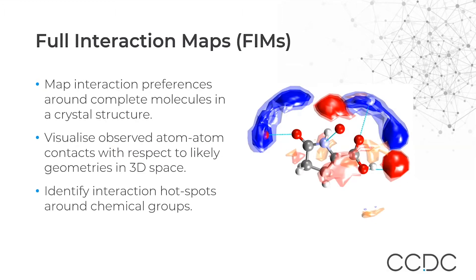Full interaction maps allow you to map the interaction preferences around molecules in a crystal structure. You have a three-dimensional map of probability for interactions, so you can look at contacts like hydrogen bonds or short contacts and rationalize them against where you would expect to find interactions for such a molecule. Full interaction maps also allow you to identify hotspots for interactions around chemical groups, and as a bonus, you can make very pretty images of where you expect to find interactions for your molecule.